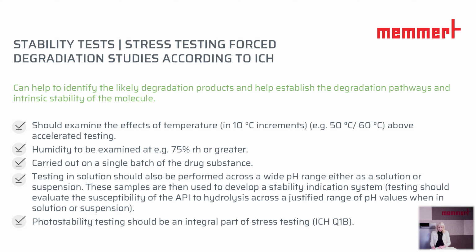The forced degradation study is an exposure of the drug substance or drug product to different stress conditions, which results in relevant degradation products. During pre-formulation, it supports the selection of the compounds and excipients for the further development. And for products, it provides information on the degradation mechanism and the potential degradation necessary for the manufacturing process and also for the packaging.